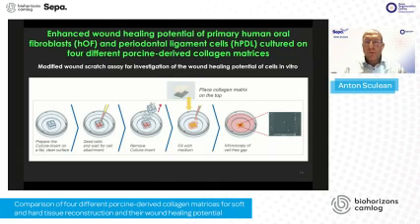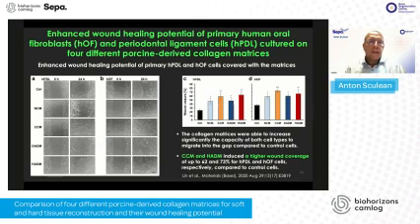So how do we do such an experiment? It is a standardized model that is very well known in the literature. You place the membranes and the cells on a plate, and then you can take a microblade, and under the microscope, you can make a wound, a so-called scratch. And then what you do is nothing else but to watch and to measure the cells that are going to cover the injured surface, okay? And as fast as they grow, you can also measure.